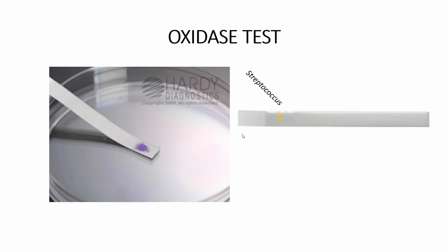So Streptococcus species show kind of a yellowish color. Staphylococcus aureus, so again, record your results. Staphylococcus epidermidis. Oh, Neisseria. So Neisseria shows our first kind of purplish bluish color, indicating a positive oxidase test. And then the last one is Micrococcus. Micrococcus is negative.